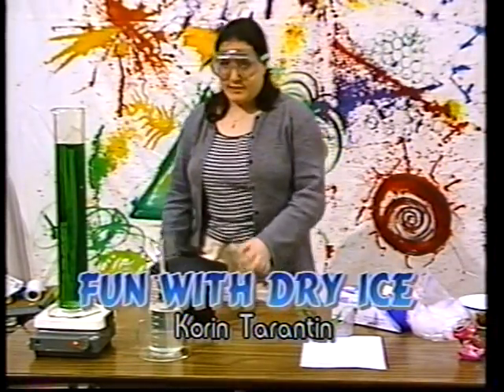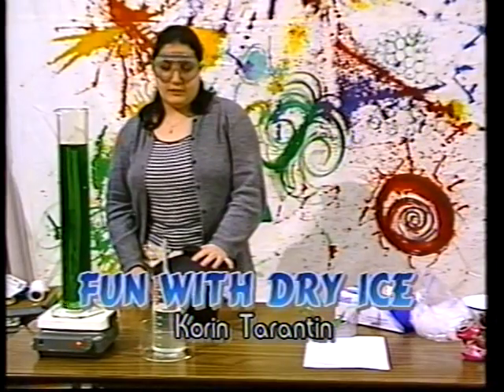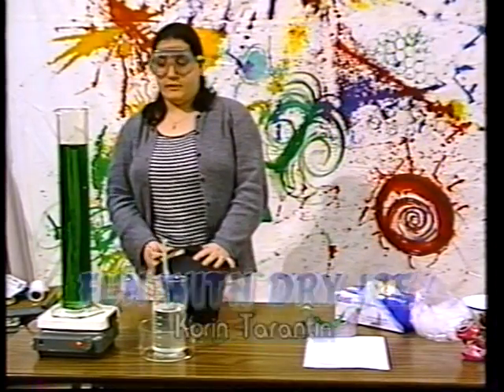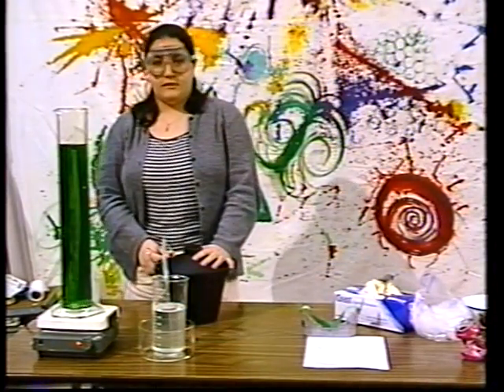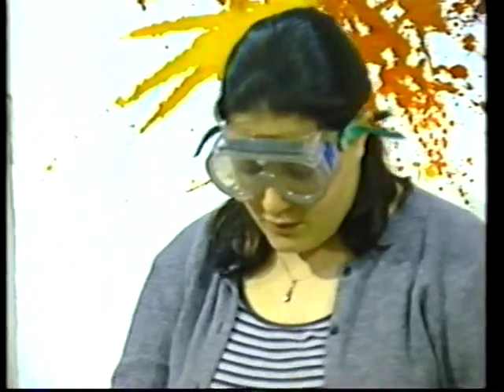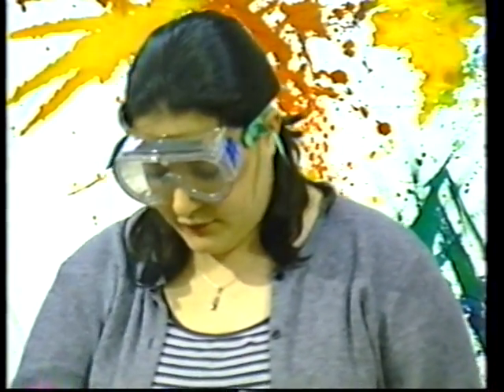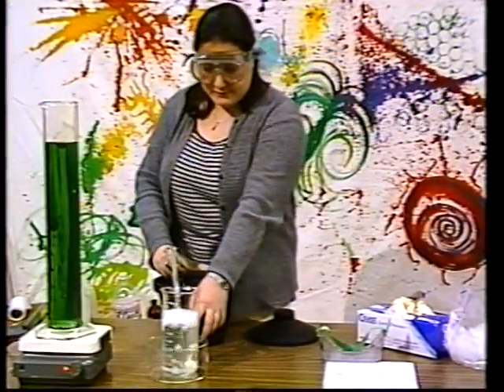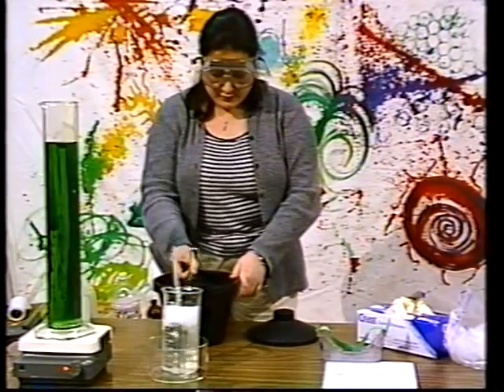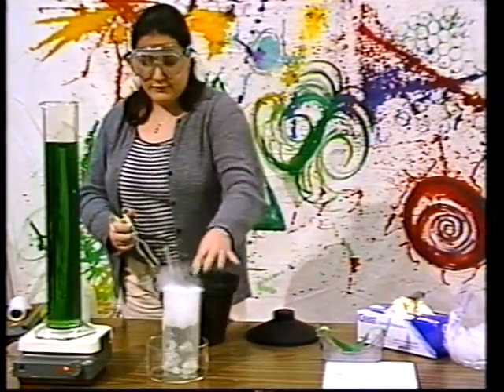This demo deals with sublimation, and sublimation is basically the change of phase from solid to a gas, not going through the liquid phase. A perfect example of sublimation is dry ice. In here I have some water and soap, and I'm going to add some dry ice, which is solid CO2. As you can see, it just bubbles into gas, not going into the liquid stage. And this is just gas and bubbles.